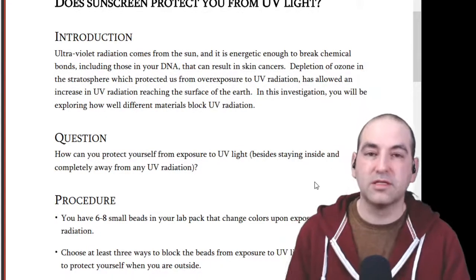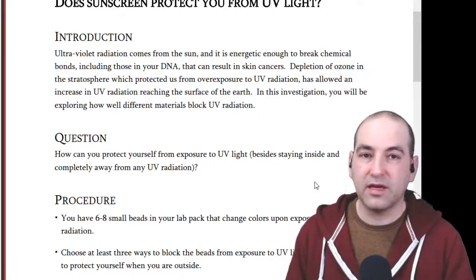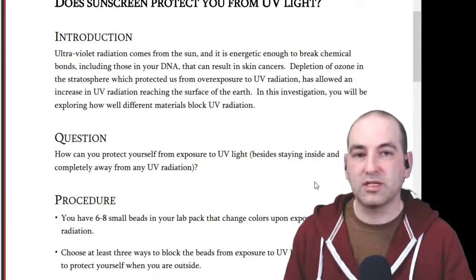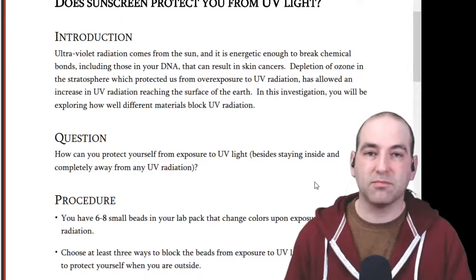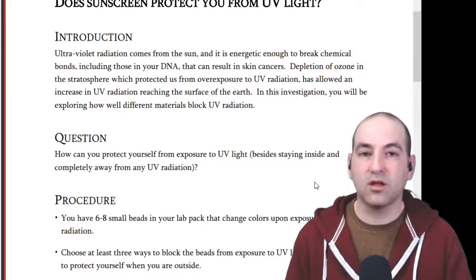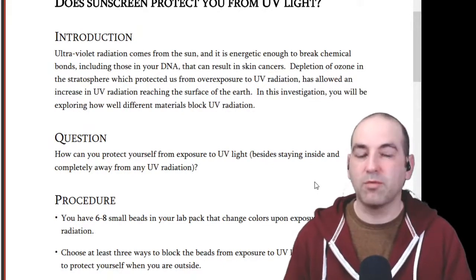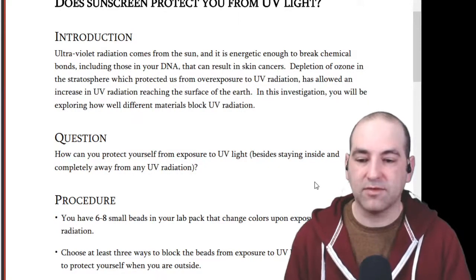All right, so you got these UV beads. There's little beads in your lab kit that absorb UV light and change color. They all are white, I believe, when they're not exposed to UV light, but then when UV light hits them, they change color. I think they were fairly randomly distributed, so you should have some perhaps different colors, and that might be something you have to think about when it comes to controlling your results. Does one color react differently from another one? If you're doing something that's carefully timed, does a purple bead change faster than an orange bead or something like that? So you may need to take a look at that depending on what you've got.